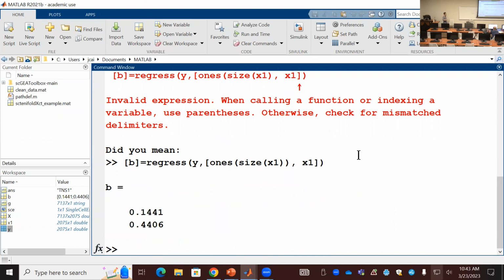So what can you get from the information from the B data? Do you have this? So which value is important for us? Is this the intercept? No, is this the slope?